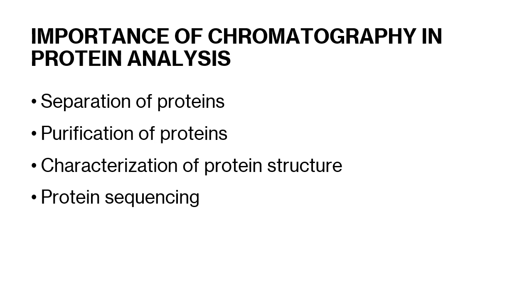And so you have here also, your chromatography also provides high sensitivity, no? And so when you say a method is sensitive, the method can detect a very low amount of protein. I mean a very low amount of sample, a very low amount of analyte present in the solution. Okay, and so with this, your chromatography is a sensitive technique, and so that allows for the detection and quantification of proteins even if they have low concentrations in a solution, no? And so they also provide a high resolution, and so that will enable the separation of proteins with similar molecular weights and structure.